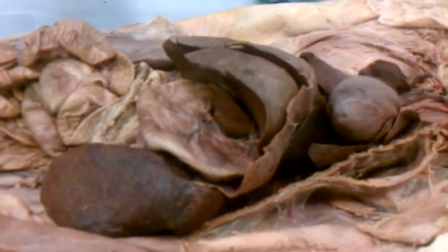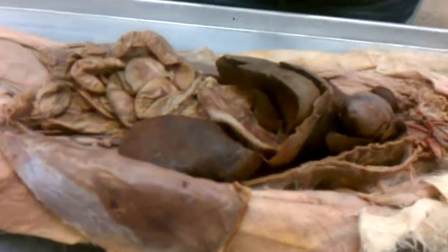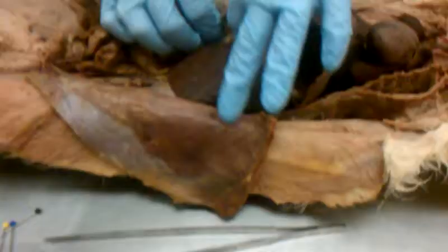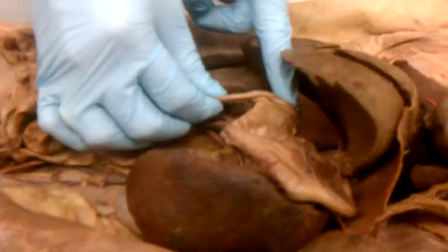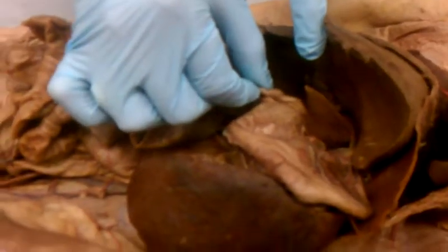Then we have the duodenum, ileum, and I need you guys to add in jejunum. I will write it on the board for spelling. If you guys want to see it, you can just write DJI, I guess, right now. But duodenum is the part of the small intestine that actually meets the stomach. So if you go to the stomach and you start with small intestine, duodenum's that first part. So if I pin the small intestine right next to the stomach, you better call it duodenum.